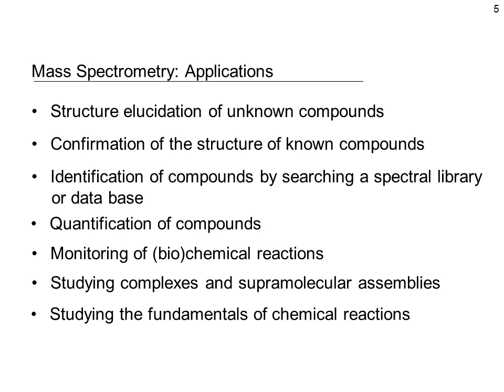We've already heard about some applications of mass spectrometry and liquid chromatography mass spectrometry in bioanalysis. But what are the general applications of mass spectrometry? What can you do with it? Very important is you can elucidate structures of unknown compounds based on their mass spectra. Not only the molecular mass, but also the fragmentation of these molecules into well-defined fragments, and the analysis of these fragments can sometimes lead to structure elucidation of unknown compounds. However, this is not an easy task. More straightforward is the confirmation of the structure of known compounds.